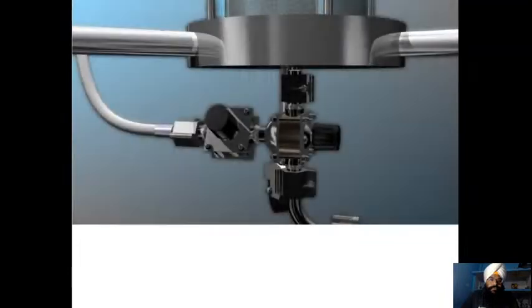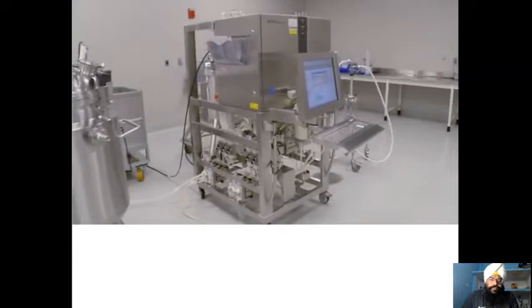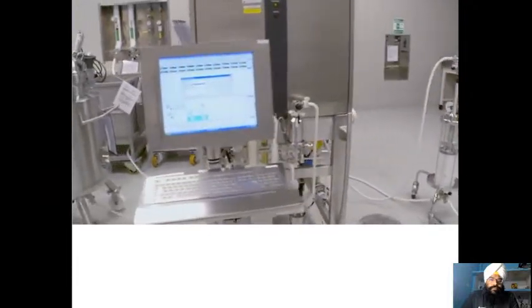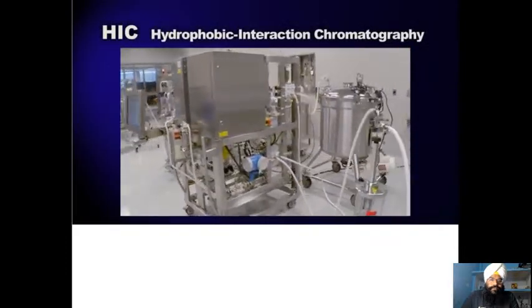When the UV sensor indicates that all of the GFP has come off of the chromatography resin, the outlet valves are switched to waste. When all of the eluate has been collected and pooled, the anion exchange chromatography step is finished, and it's time for HIC, Hydrophobic-Interaction Chromatography.